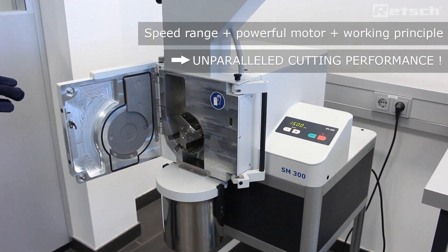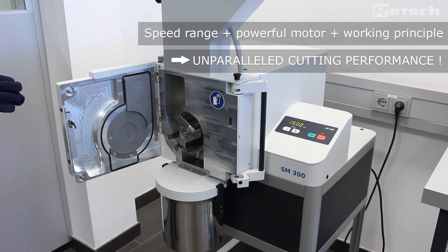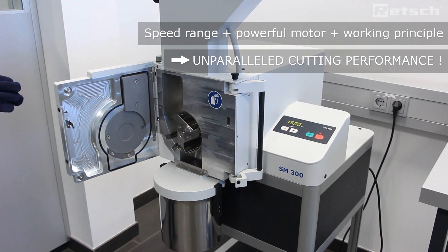And the SM300 instrument is the only variable speed cutting mill available on the world market today.